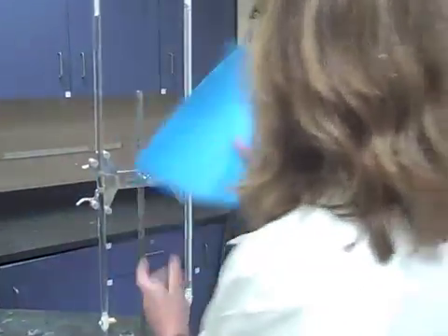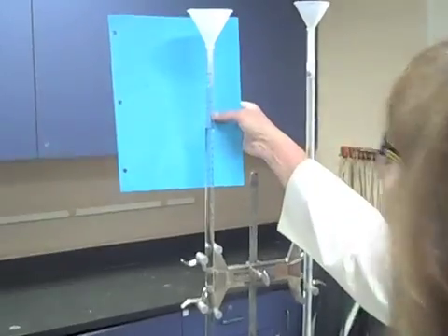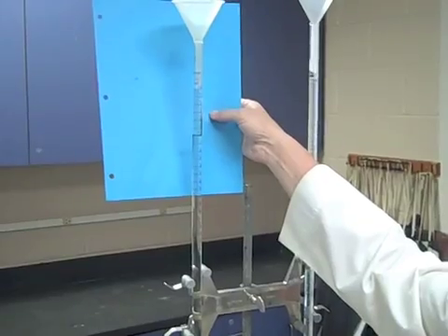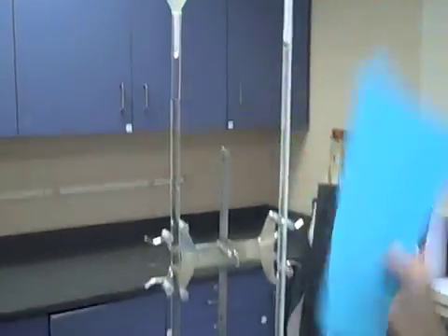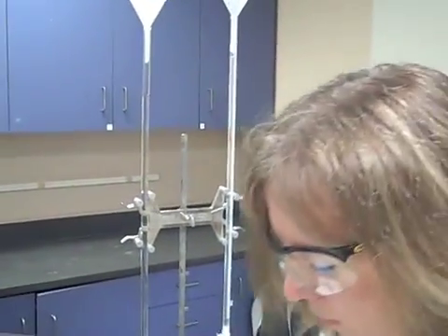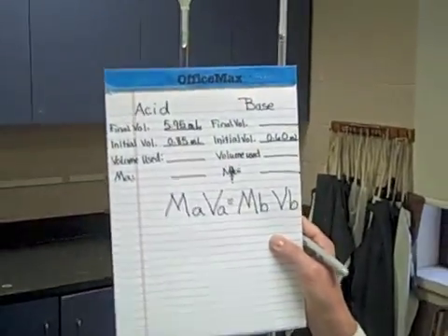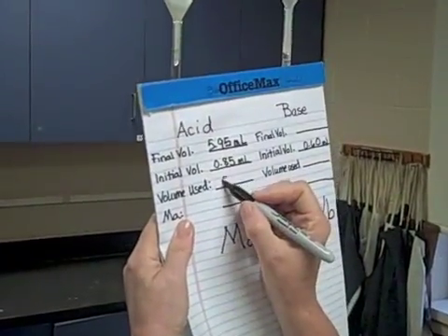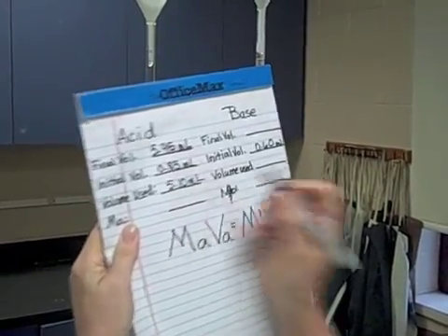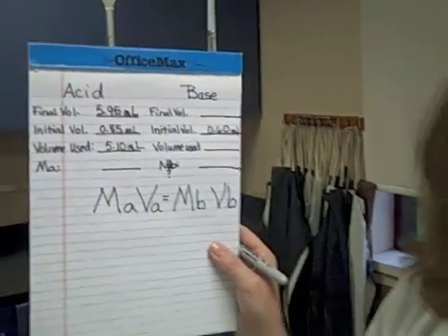I'm going to take a reading now. And my reading tells me that I'm at 5.95. 5.95 as my final volume. So that means that I am using 5.10 milliliters of the acid in this titration.